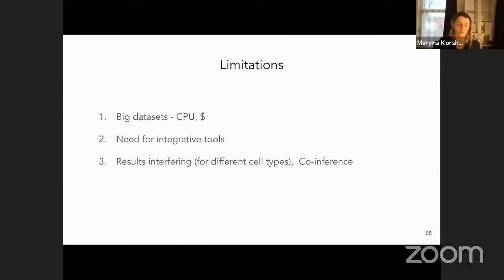Yeah, so in brief, the limitations of multi-omics analysis, on the technical side, are that first of all, it's a very big data set, much more so, because you group everything. That is why the size of the data set arises, and the power that you have to put into analyzing this data set also rises, with non-linear correlation.